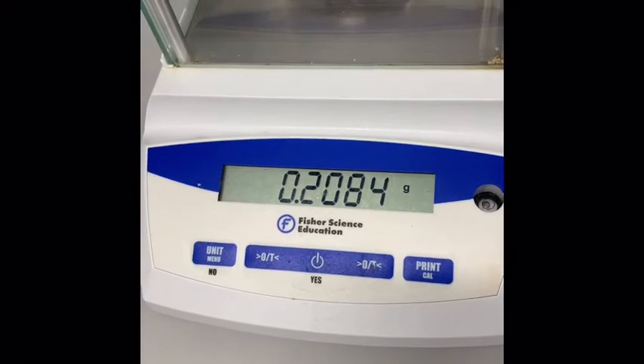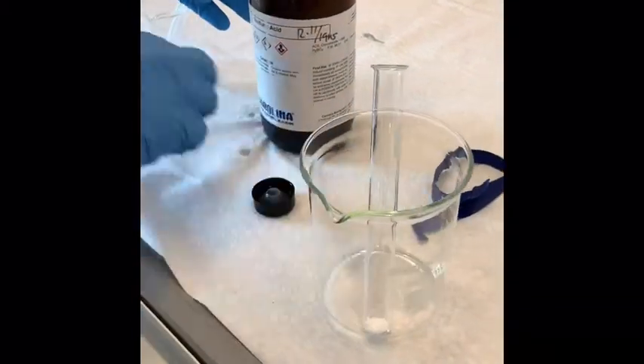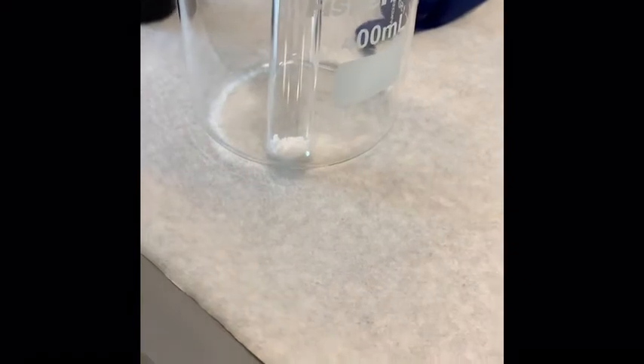We will go get the sulfuric acid next. Now we are adding our sulfuric acid. We need to add half a milliliter to our test tube that is containing our oxime.